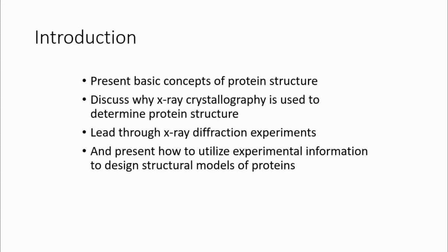Now just a brief idea. I think you must have already had your classes on protein structures, how complex a protein structure looks, with its various primary, secondary, tertiary and quaternary structures, right? And as the complexity of these structures keeps on increasing with the number of folds, the problem arises because they become densely compact into a small spatial area. More folds means more protein layers, correct? So the structural identification of these complex structures is not very easy, and that is why X-ray crystallography has a little bit more advantage compared to the previous CD, right?